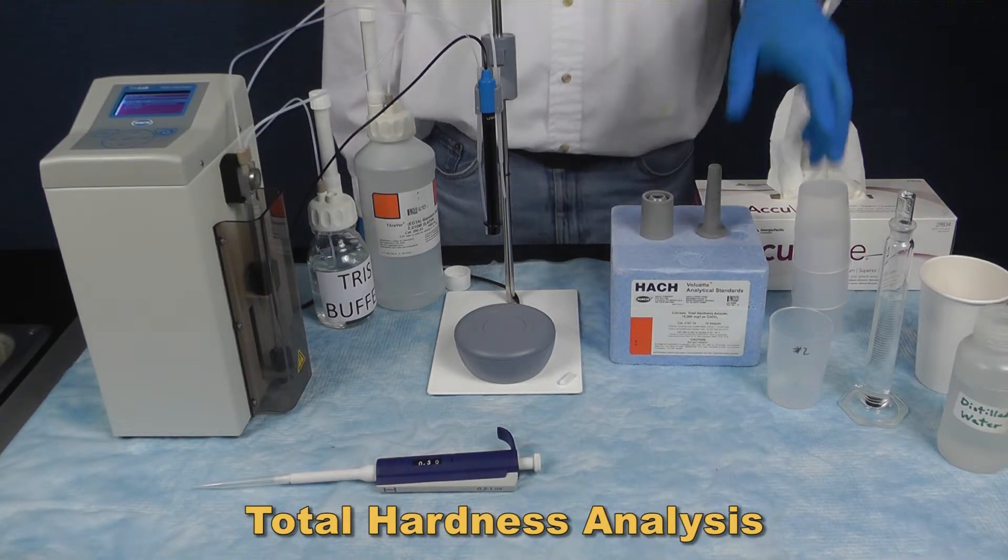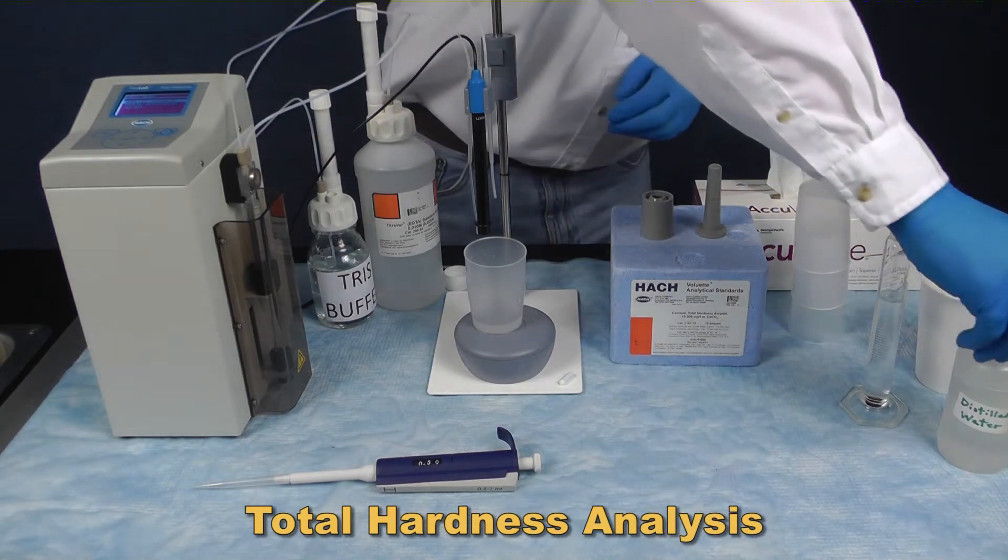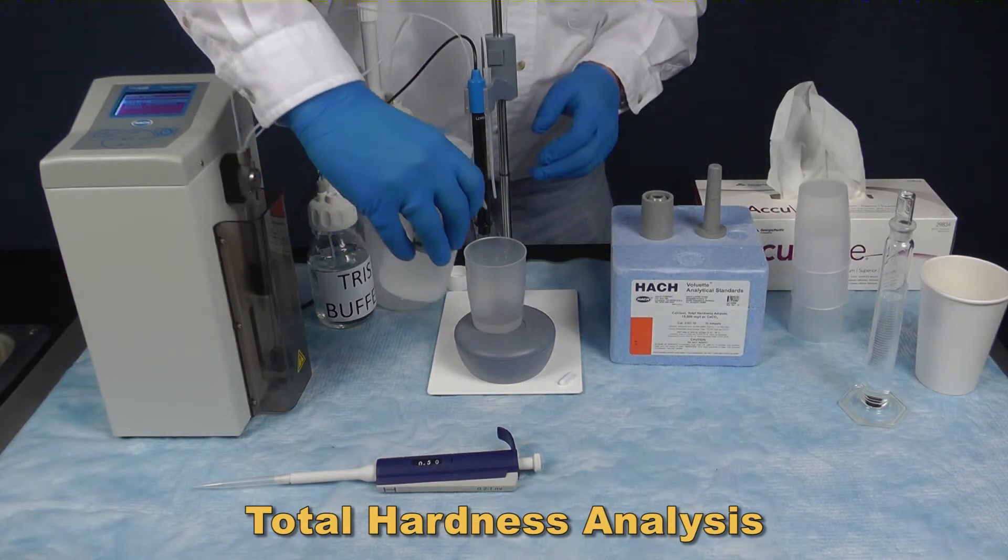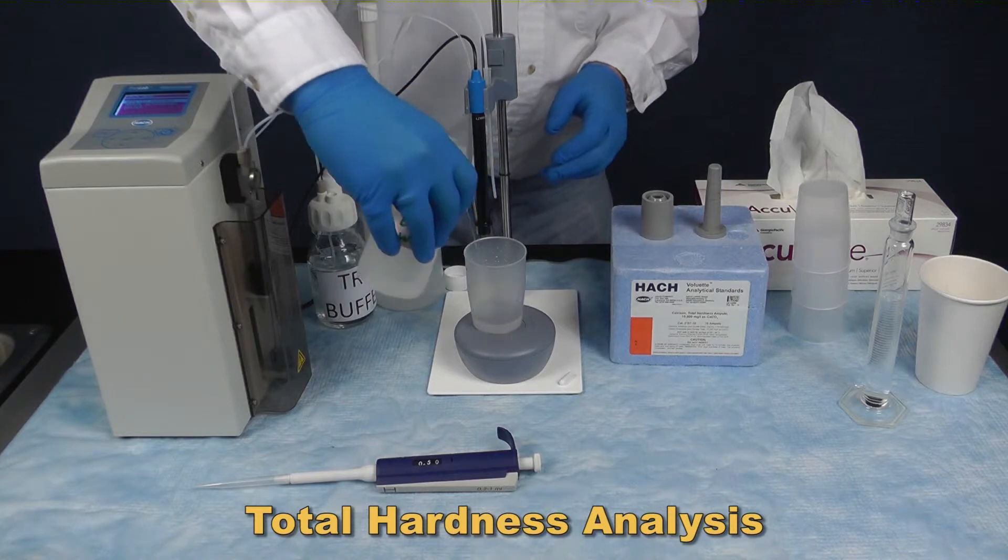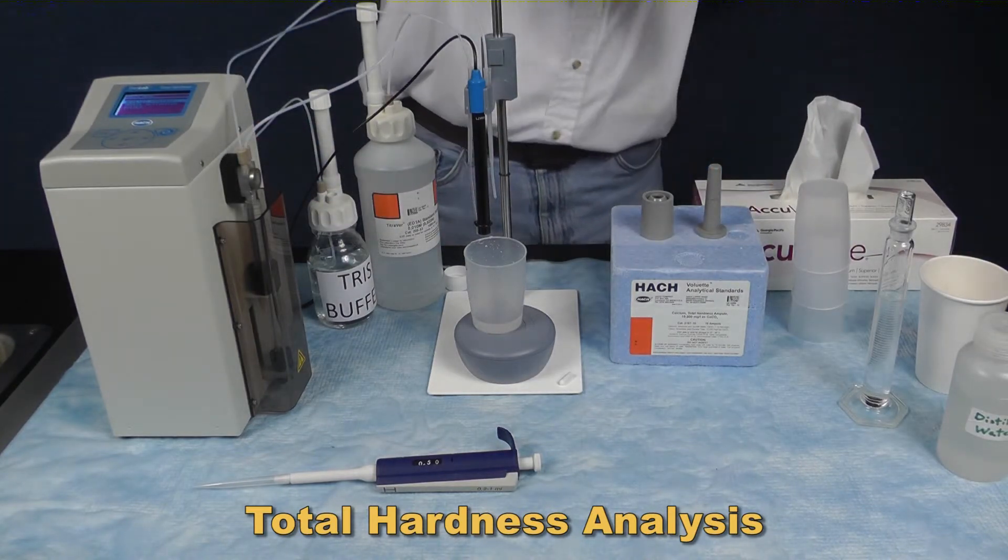We are now ready to run the analysis. Place a waste beaker under the probe on the stand and rinse well with DI water. Blot the probe dry using a chem wipe or acu-wipe.